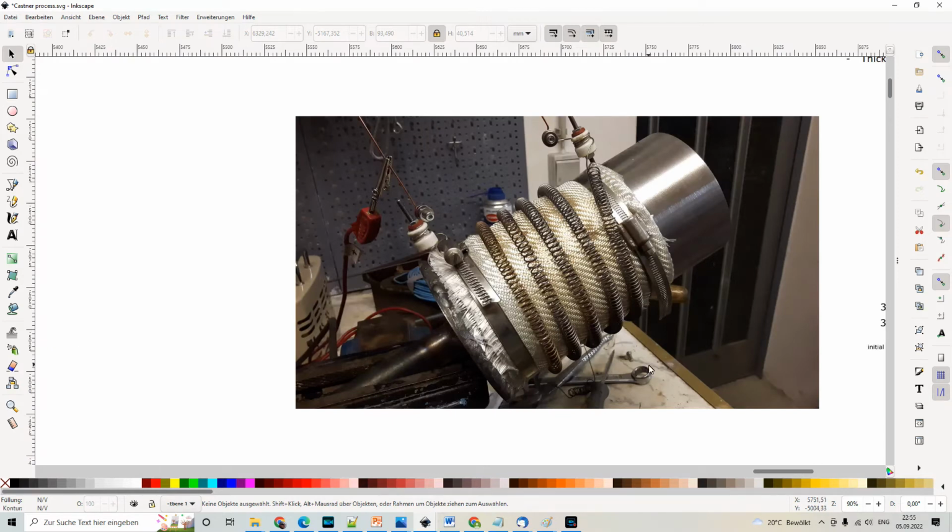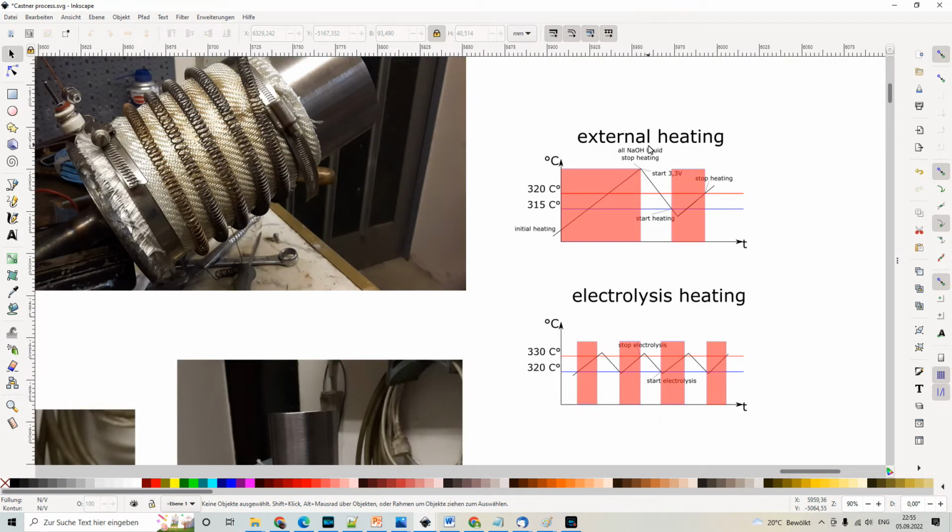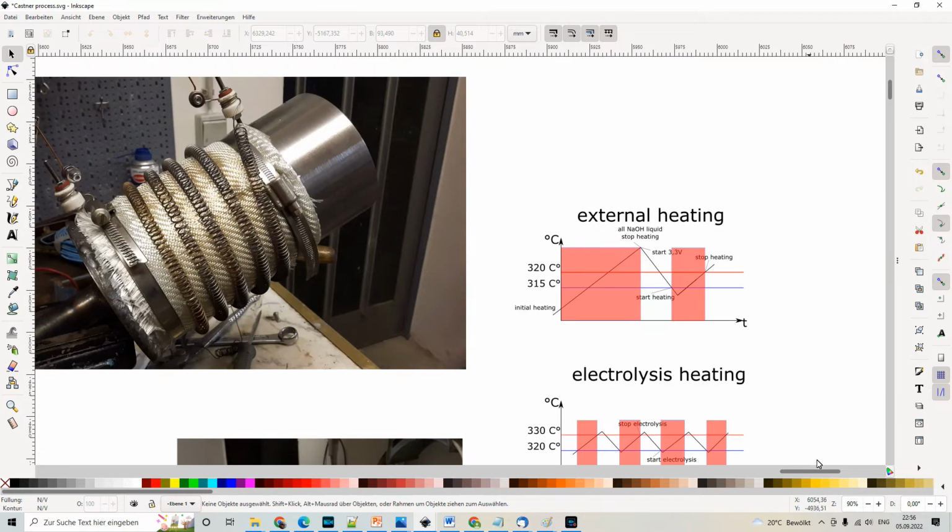So now we are going to discuss the heating of the cell, it's actually apparent that we are having two heat sources. First of all, the external heating, and then the heating caused by the electrolysis. And in order to master the process, it's very important to understand and to take both into consideration and to control both of these heatings to make everything work smoothly.